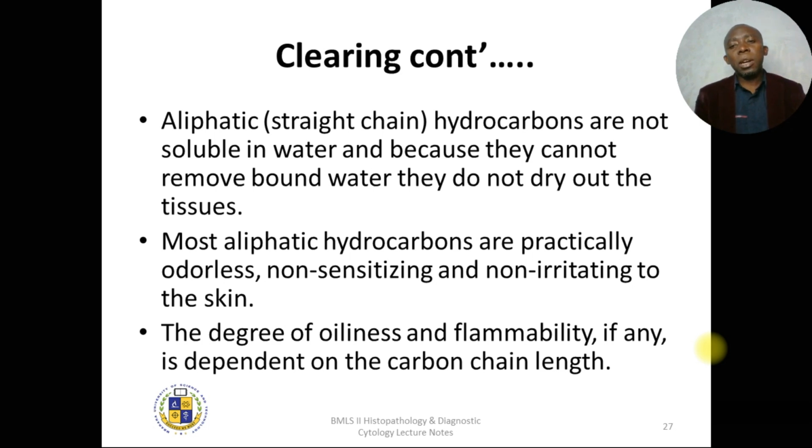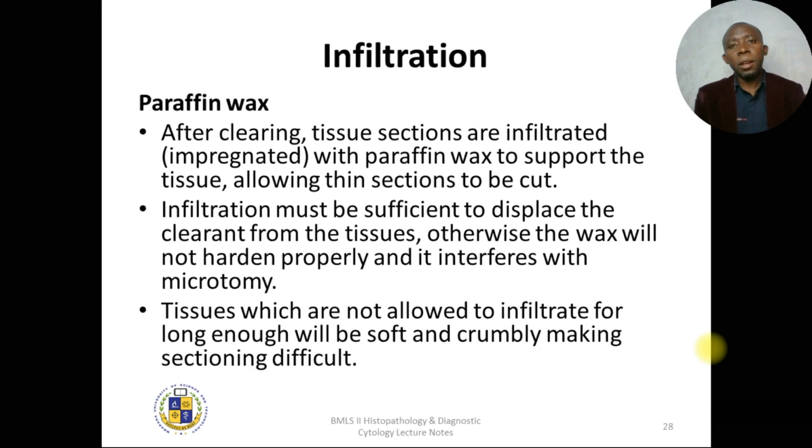Most aliphatic hydrocarbons are practically odorless. Though the others have the citrus smell, these are odorless, non-sensitizing and non-irritating to the skin. The degree of oiliness and flammability, if any, is dependent on the carbon chain length.